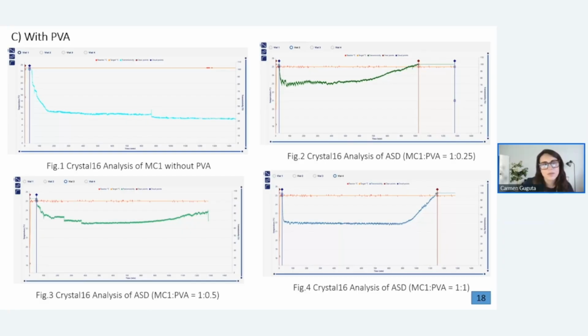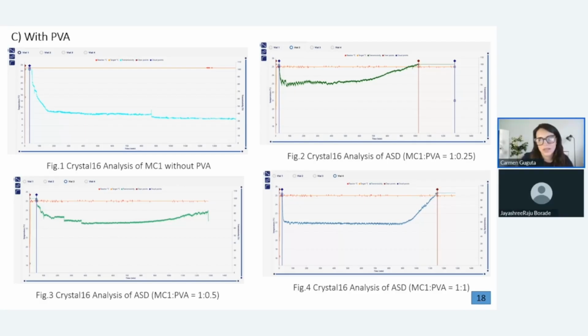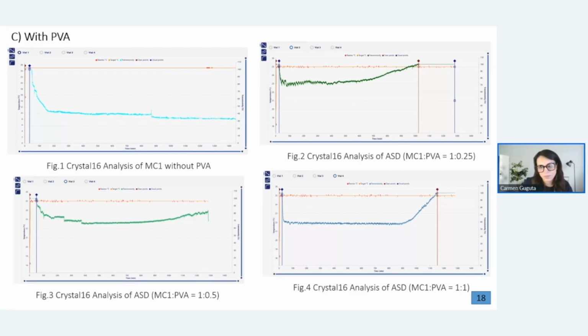So we need the minimum polymer concentration, otherwise we will have to do a lot of experimentation to identify what amount of minimum polymer we should be adding. If these experiments indicate that the LOC is pretty high with respect to the API concentration, we can definitely reduce the polymer concentration and it can be a high drug load API ASD.